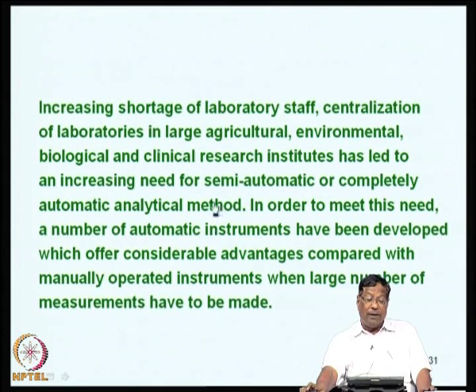In fact, it was the improvements in AAS that have led to automation in several other instruments such as spectrophotometry, ICP, etc. So, AAS is the leader where anything that is required in terms of a process control or optimization, data handling, etc., this has led the way. So, in order to meet this need, a number of automatic instruments have been developed, and that we have already discussed.